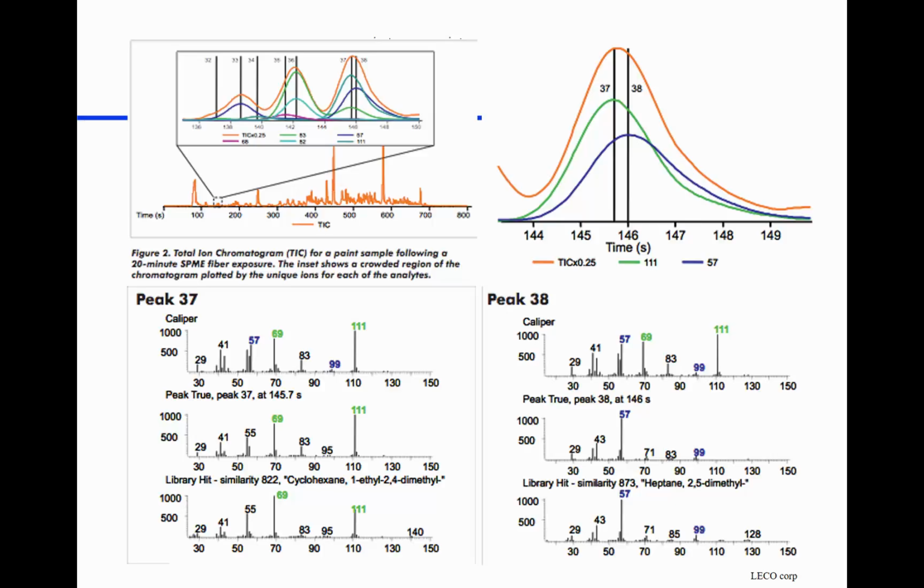This is the type of data that you get out of it, coming out of your mass spectrometer. It's simply counting how many ions are there at mass 29, 38, 39, 40, 41, and so on. So you do get this mass spectrum out of the system. Since we've talked about this before, I won't bother anymore, but the computer is doing matching between the library spectrum and what it picks out of a complex spectrum up above.